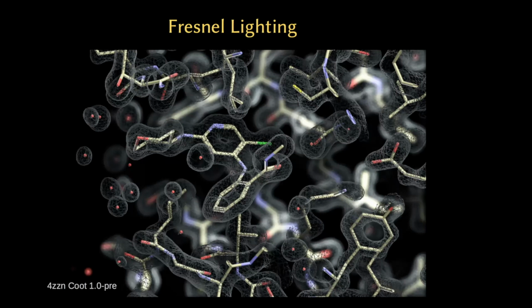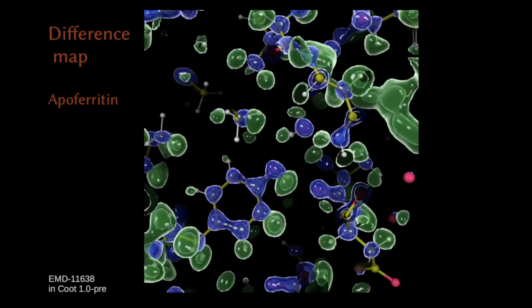Additionally, in this representation, you can see I blurred out the background, and that also brings something to the representation and interpretability. This is an in-the-clinic anti-cancer ERK1 inhibitor, by the way. Again, using Coot for representation of the map. So this is sapphires and emeralds, but no rubies.